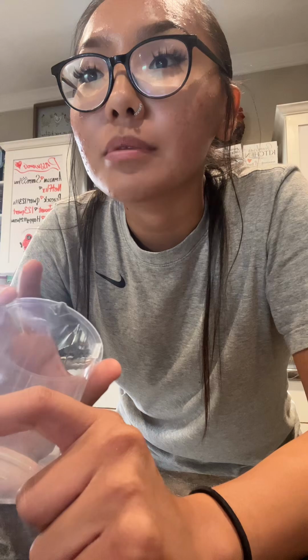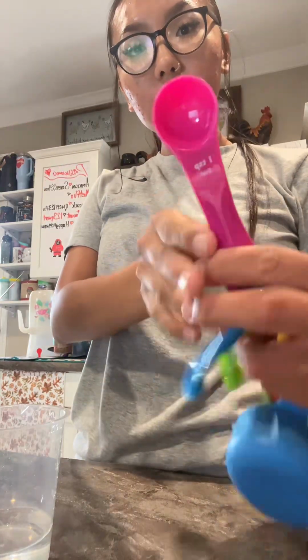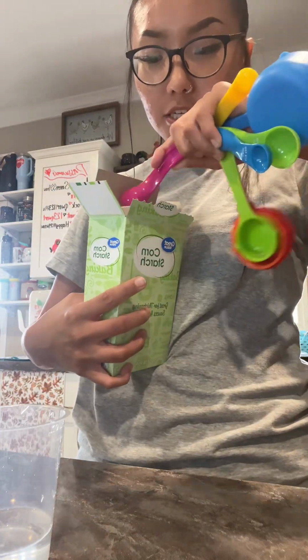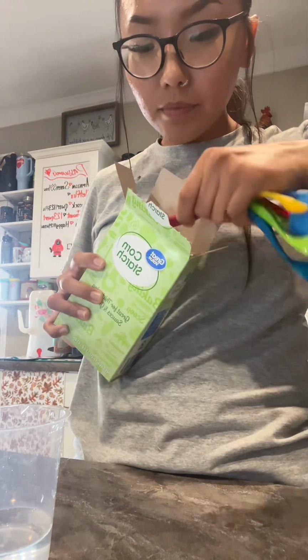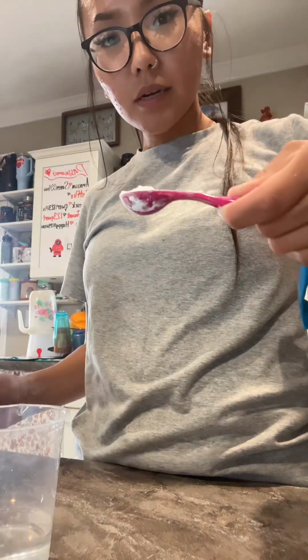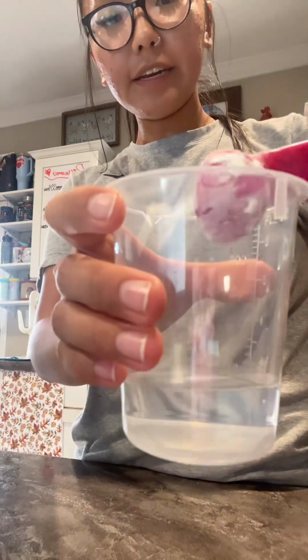Now that that's done, next we're going to prepare the starch by mixing 50 milliliters of distilled water with 1 tablespoon of cornstarch, and we're going to heat this mixture. We're going to microwave it for 10 to 15 seconds to help the starch dissolve in the water. So we have our teaspoon, and now we're going to add 1 tablespoon of cornstarch. I'm gonna add it in here.